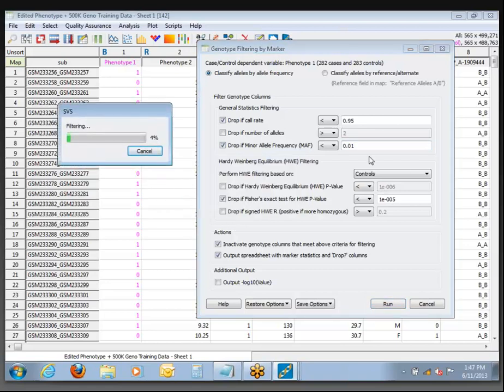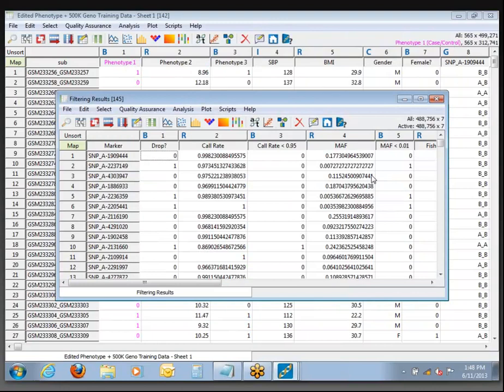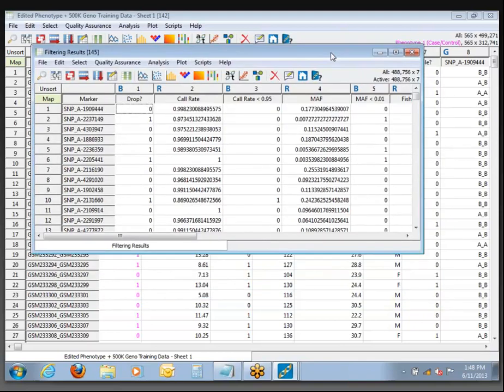The reason for using only controls in Hardy-Weinberg filtering is that if there is a positive allele driving the phenotype, we would expect that SNP to be unbalanced in the cases. Hardy-Weinberg filters became common in GWAS mostly because of chips that were biased towards calling one allele over another. If you focus on the controls, you can figure out which ones are balanced and calling appropriately. Of course, if you have a stratified sample with representation from different population groups, Hardy-Weinberg filters will probably recognize some SNPs that are differently distributed in various populations.